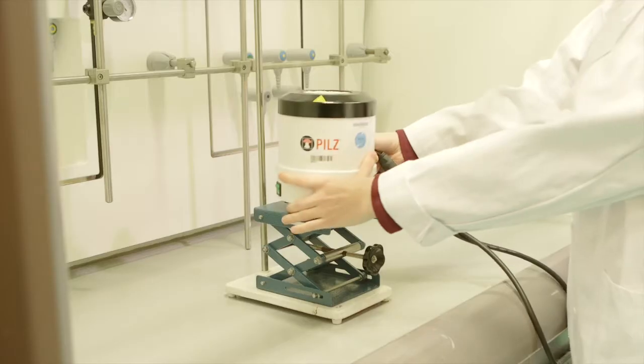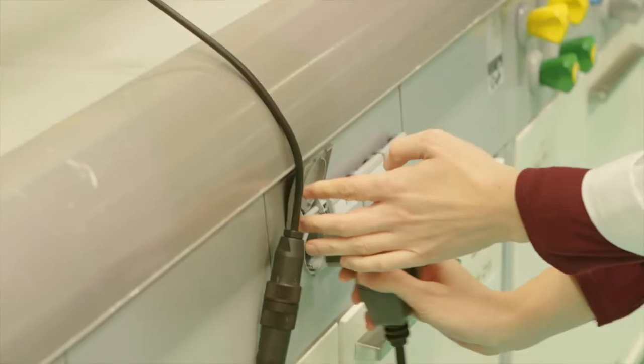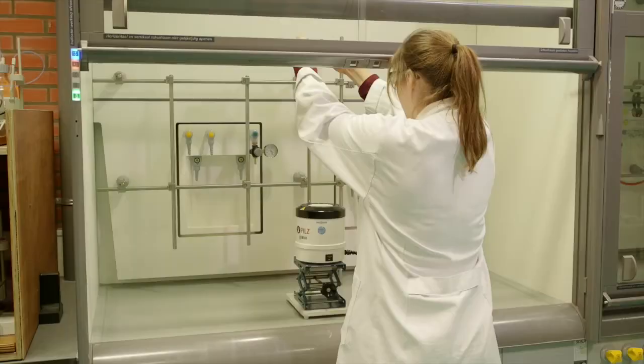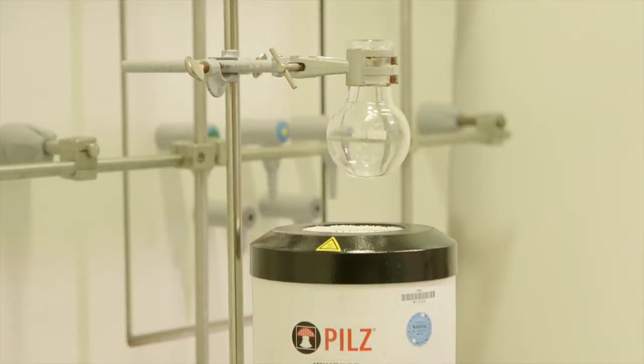Raise the jack and place the isomantle on it, and stab the plug into the socket. Attach a clamp to the stand and hang the round bottom flask in it. Make sure the clamp rests in the holder.